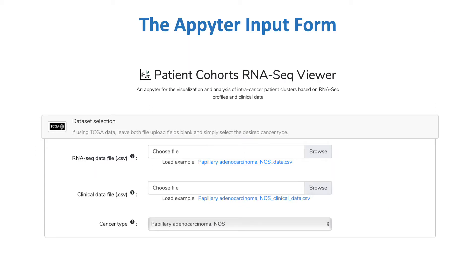Here's what the input form looks like for my appyter. The appyter creator is able to divide the input fields into various sections, and if you click on any section header, you'll expand that section to set the related fields. Here you can see the section for dataset selection, where the user can either upload their own RNA-seq and clinical data files or select a TCGA cancer type from the drop-down to load that cohort. I'll now be running through some highlights of the appyter output if you were to select papillary adenocarcinoma from the drop-down and leave all other parameters as their default values.